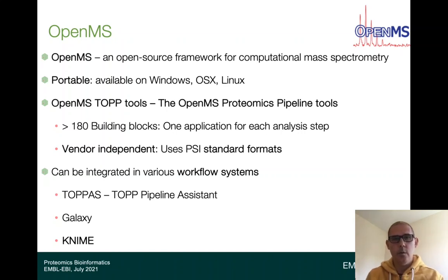One of the most interesting points is that it is based on PSI standards. It supports mzML, mzTab, mzIdentML. I think you have seen these file formats within the course, and it has also been integrated with some workflow systems.